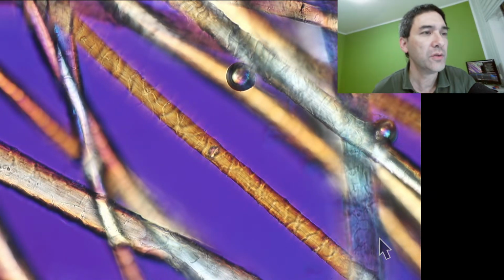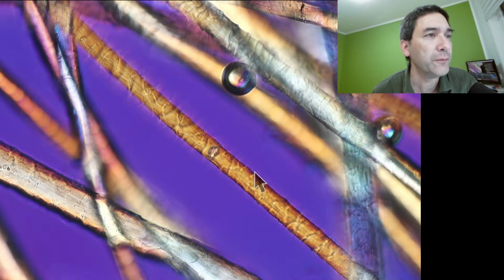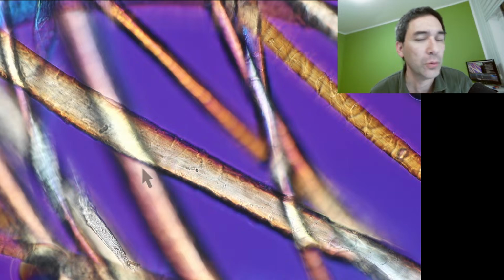If you look at the surface, where's the arrow again here? If you look at the surface, you see that it is irregular. It has these scales, right? And that is typical for hair. Synthetic fibers would look very different. They would be much more homogeneous and smoother. So this is one indicator, and another one is, look at this. Some of them are thinner, others are thicker, right? So you already know just by looking at it that this is not artificial synthetic, but actually natural wool.